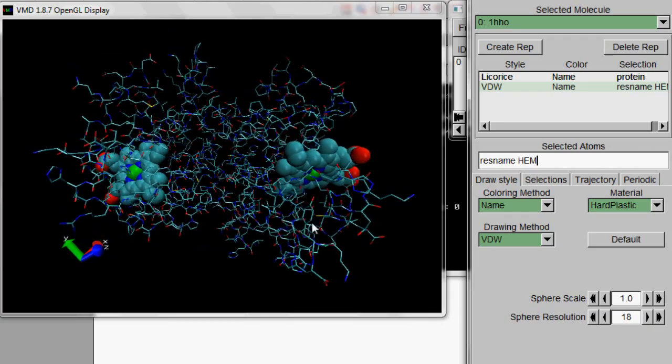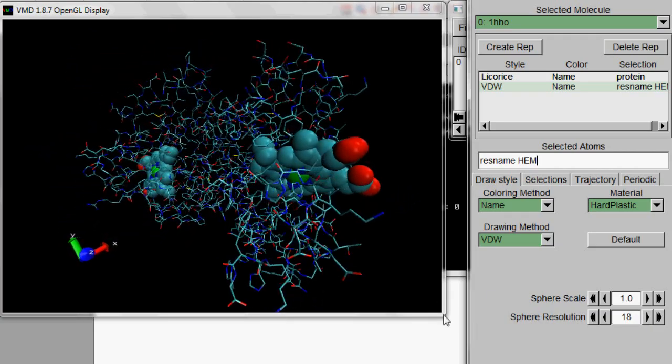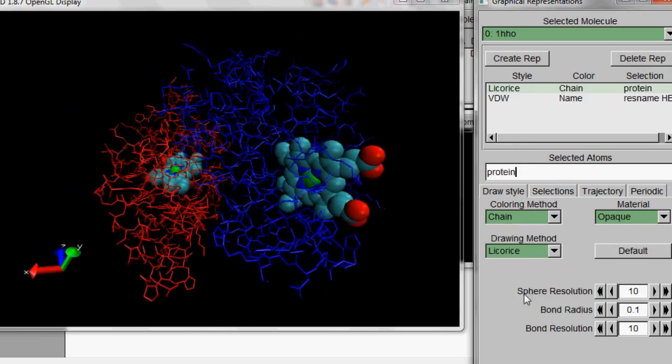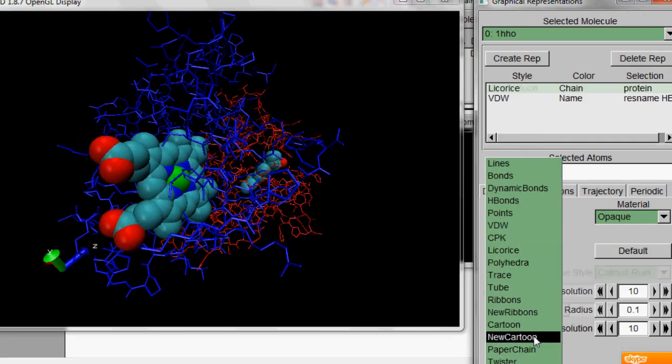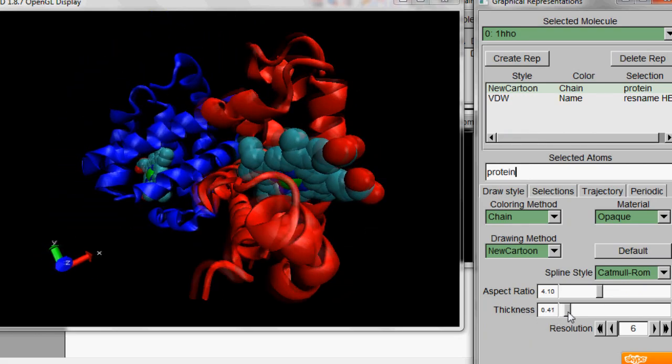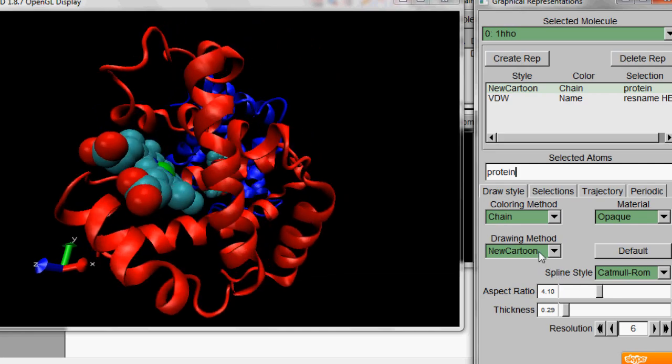Fantastic. So now you can see the heme easily. Let's change the protein representation and change the color method from name to chain. And change the protein representation from lines to new ribbon. Now we can see the protein structure is actually two molecules. Each one with a heme group.